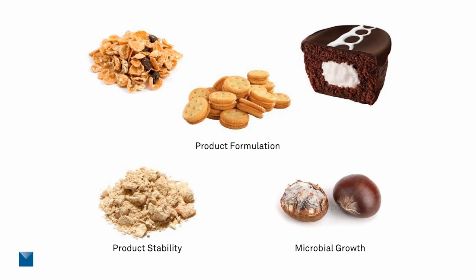Have you ever wondered how you can have a nice tender raisin and a crispy bran flake, or a snack cake that can maintain the texture of all of its components? And the same with the cheese-filled cracker. How can you avoid caking and clumping issues with ingredients, or determine if your product will be susceptible to spoilage? All of these examples are controlled by water activity. If you understand how water activity works, you'll be able to develop products that are stable and desirable to the consumer and can predict and prevent potential problems.